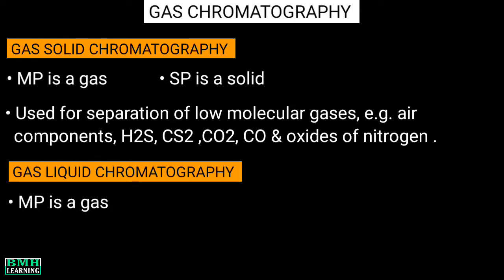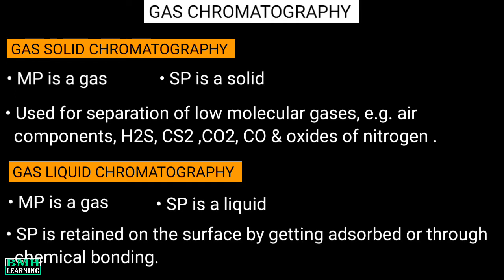The second is gas-liquid chromatography. Here the mobile phase is a gas, while the stationary phase is a liquid, which is retained on the surface by getting adsorbed or through chemical bonding.